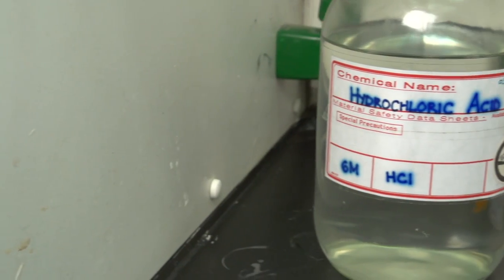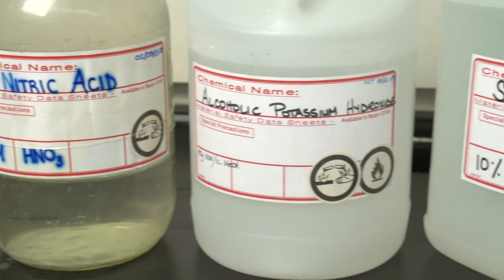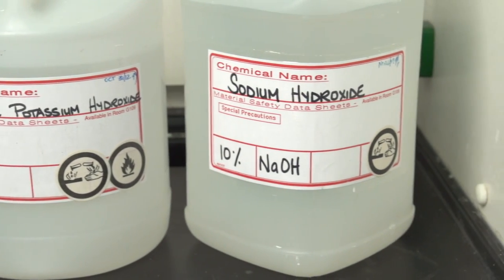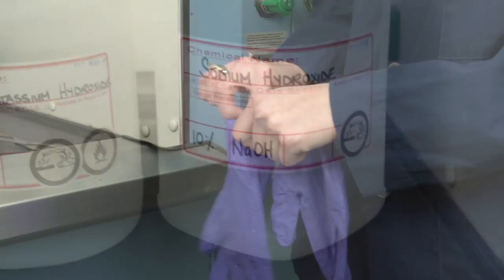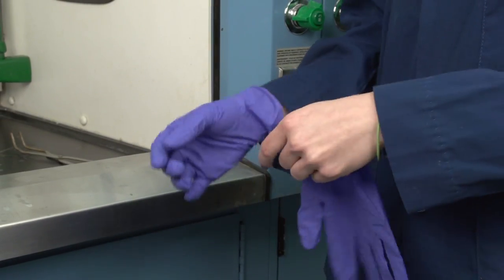If glassware becomes too dirty or contains chemical residue that cannot be washed with detergent and water, it has to be cleaned using a chemical cleaning agent. Chemical cleaning agents are corrosive so the use of appropriate gloves is mandatory.